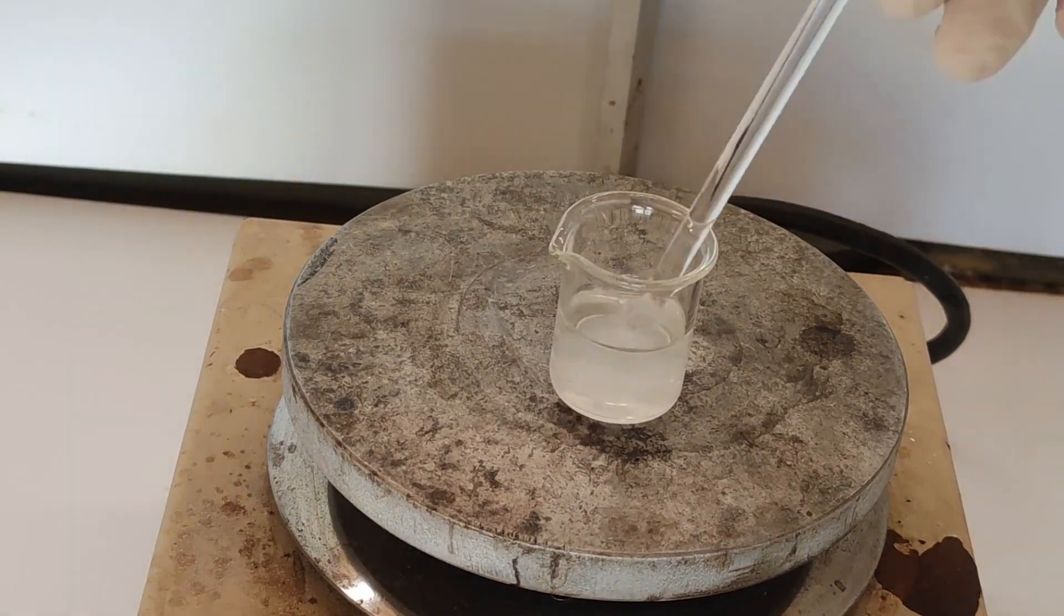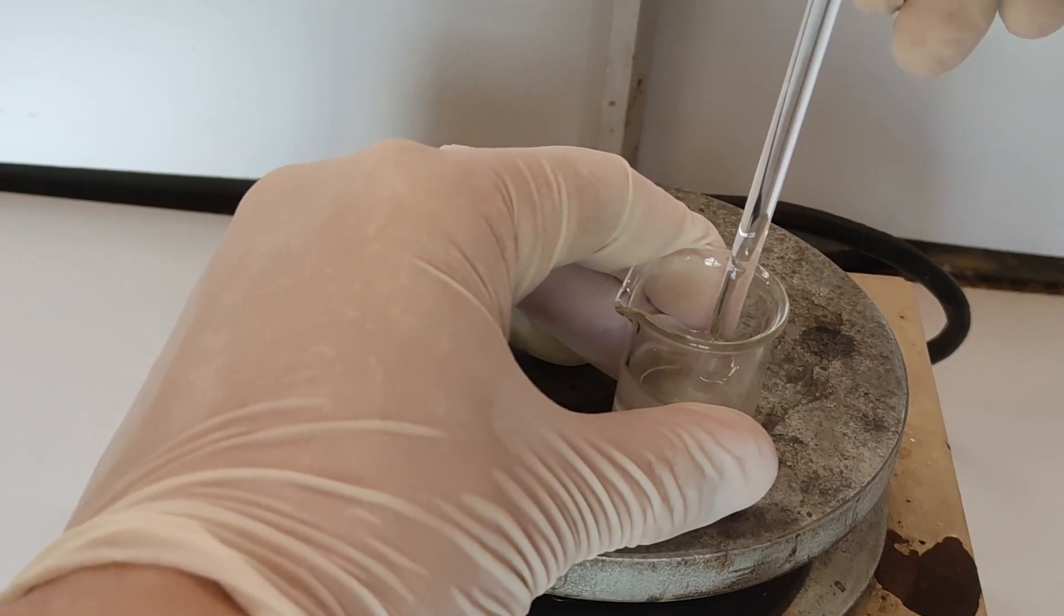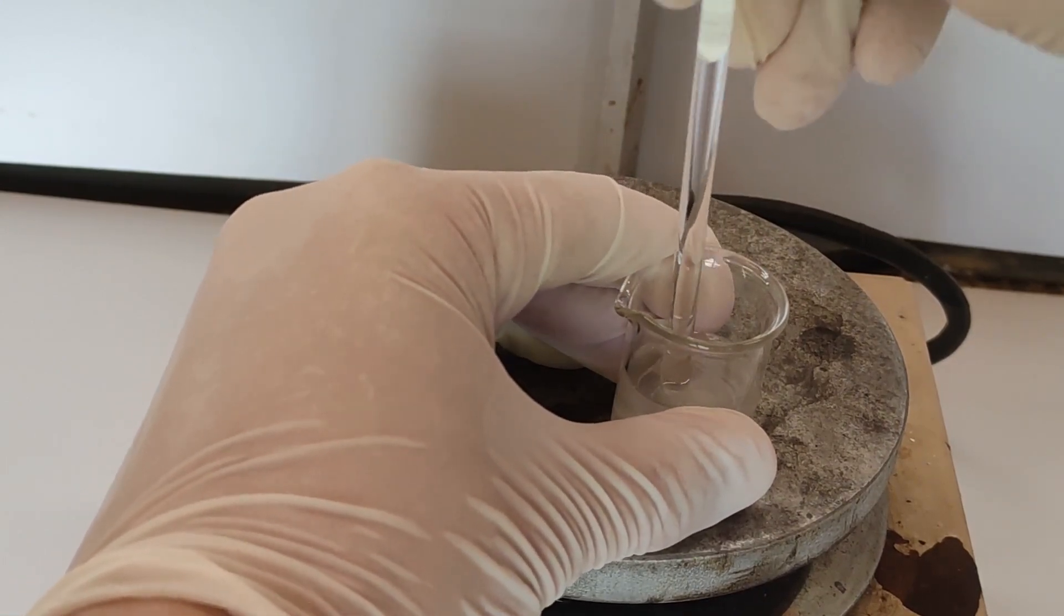First, some sodium hydroxide is dissolved in a small amount of water. This will prevent decomposition of the sodium borohydride later on in the synthesis.